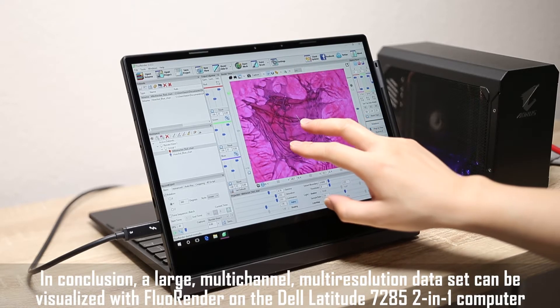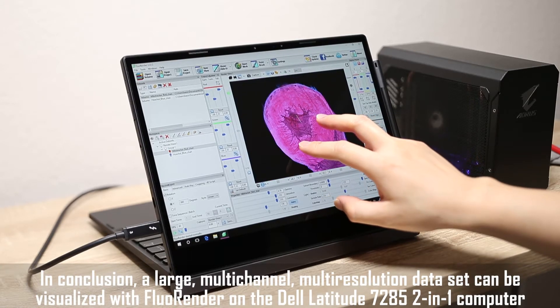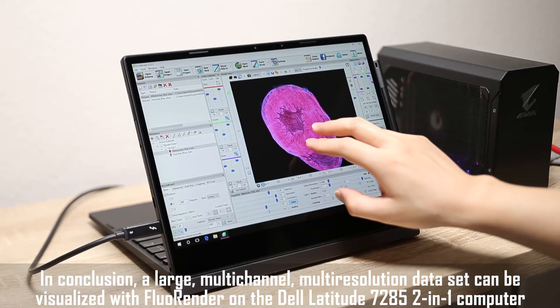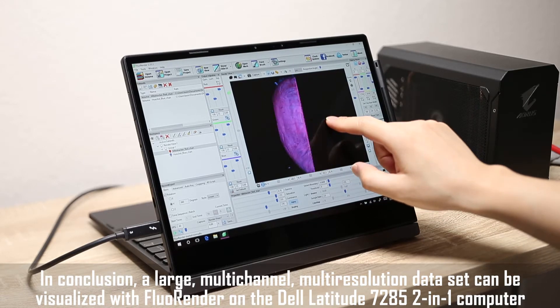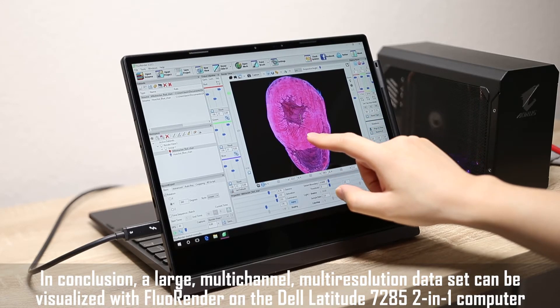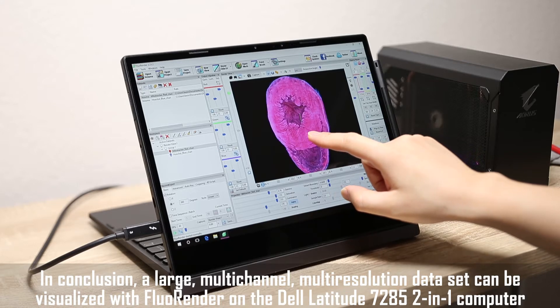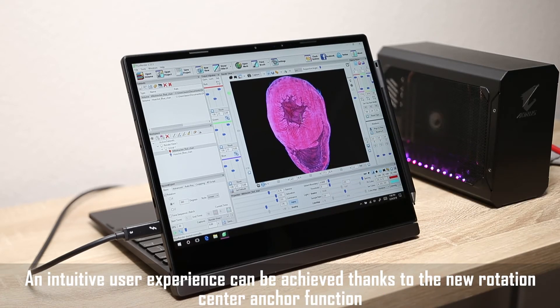In conclusion, a large, multi-channel, multi-resolution data set can be visualized with FluoRender on the Dell Latitude 7285 2-in-1 computer. An intuitive user experience can be achieved thanks to the new rotation center anchor function.